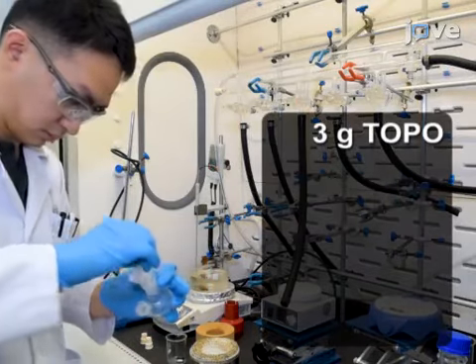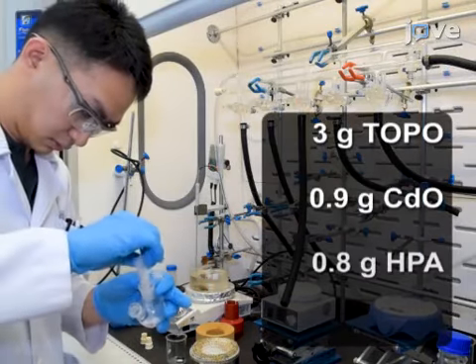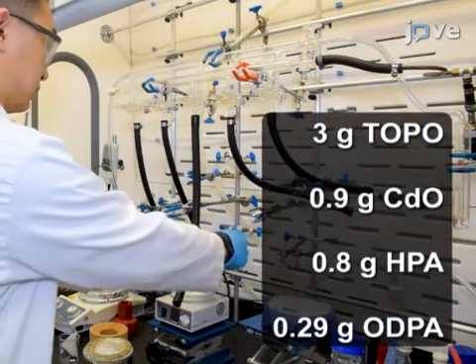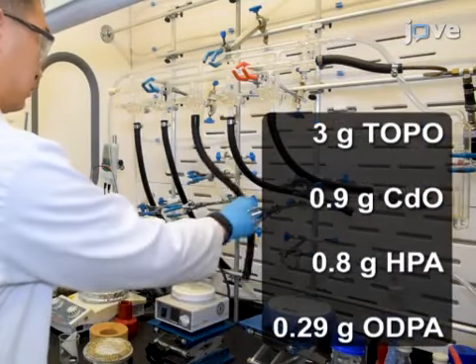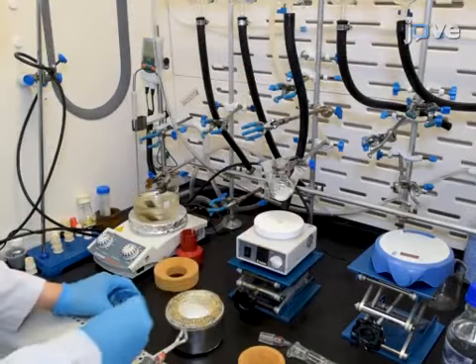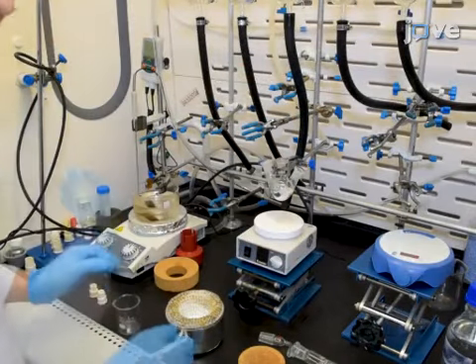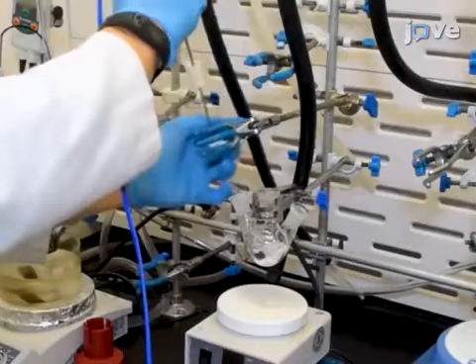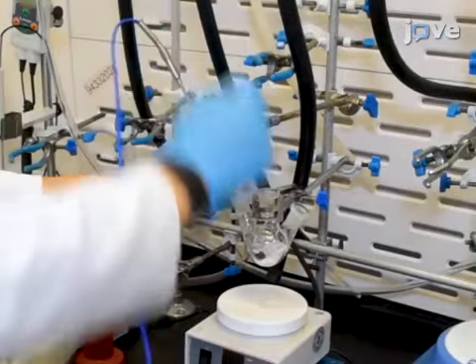First, add TOPO, cadmium oxide, hexyl phosphonic acid, and octadecyl phosphonic acid to a 50 ml 3-necked round bottom flask. After adding a magnetic stir bar to the mixture, insert a temperature probe through a punctured rubber septum and seal one of the ports of the flask with the septum.